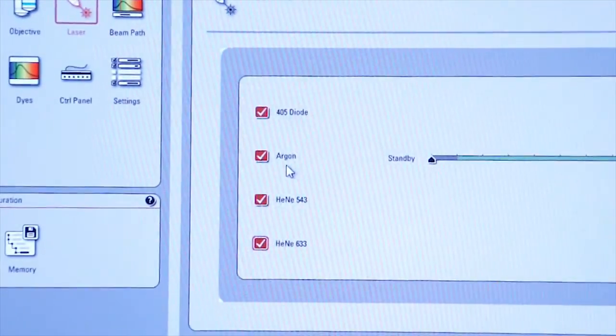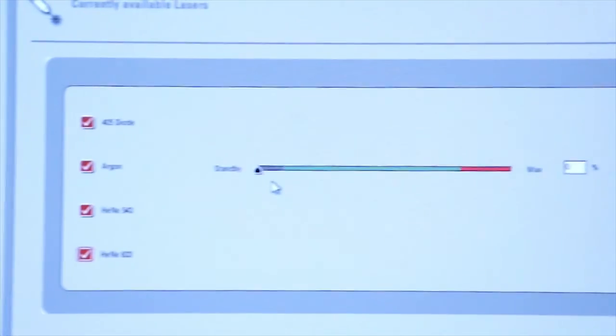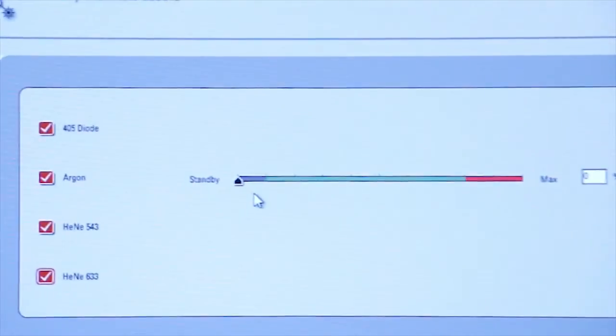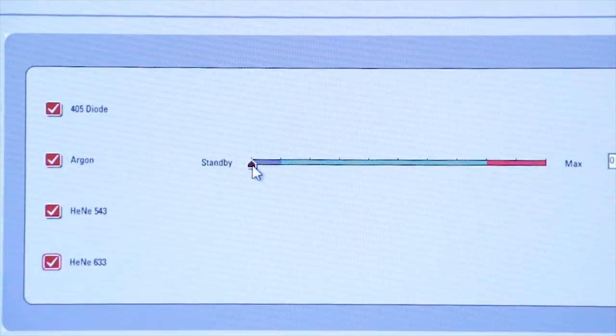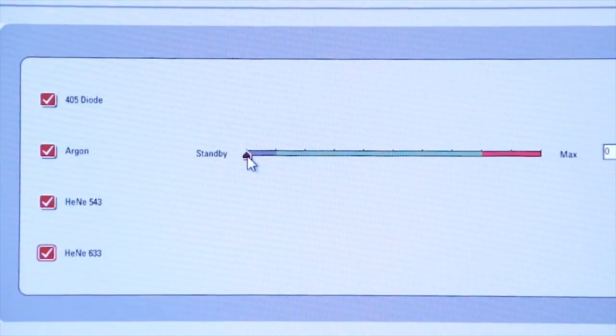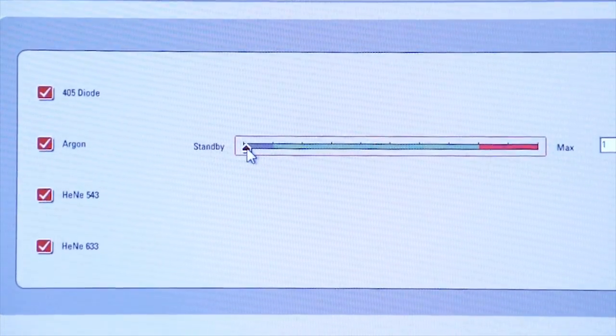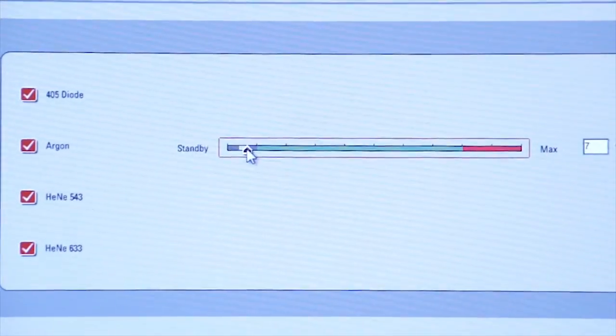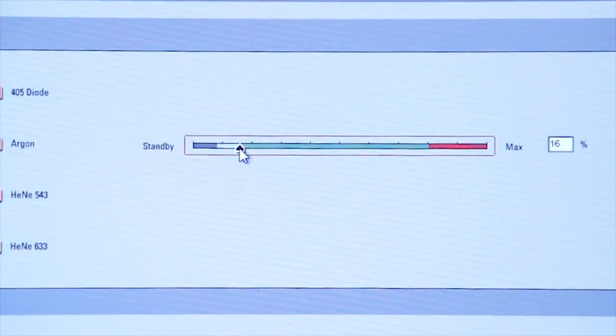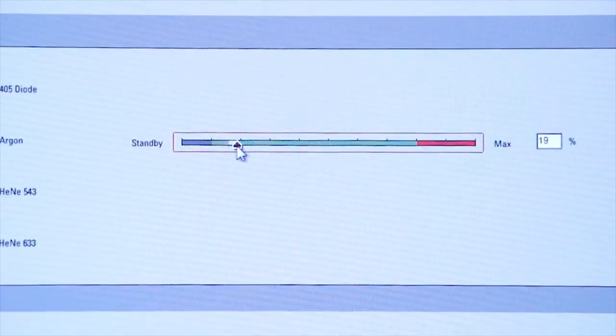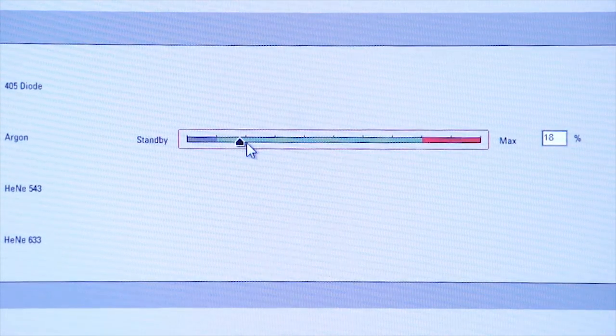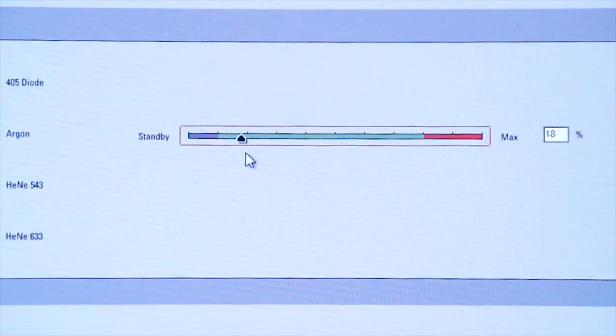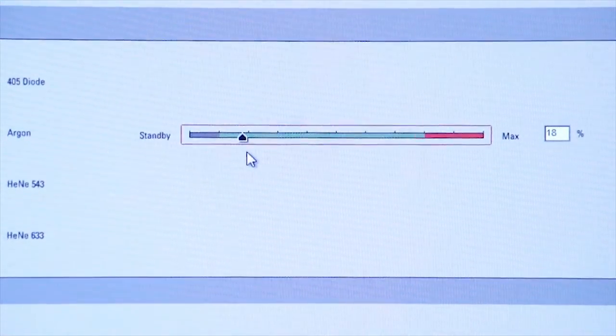Notice that the argon laser has a slider bar for application of power. We need to bring the power for the argon laser up to about 20%. So you bring it to 20%, don't go any further, and leave it at that point.